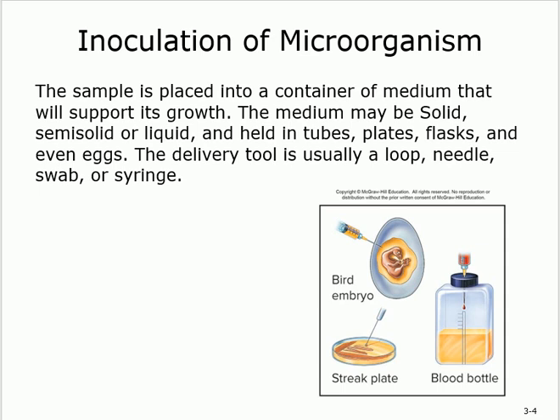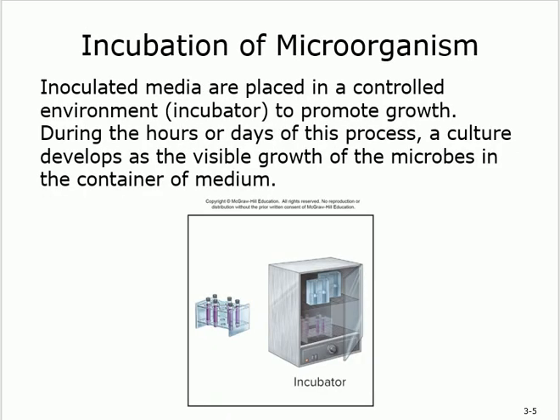Swab, something like the Q-tip. So any one of those can be used to transfer and to inoculate. And the next step is to do incubation. When you incubate the organism, as I mentioned, meaning you put it in an incubator.